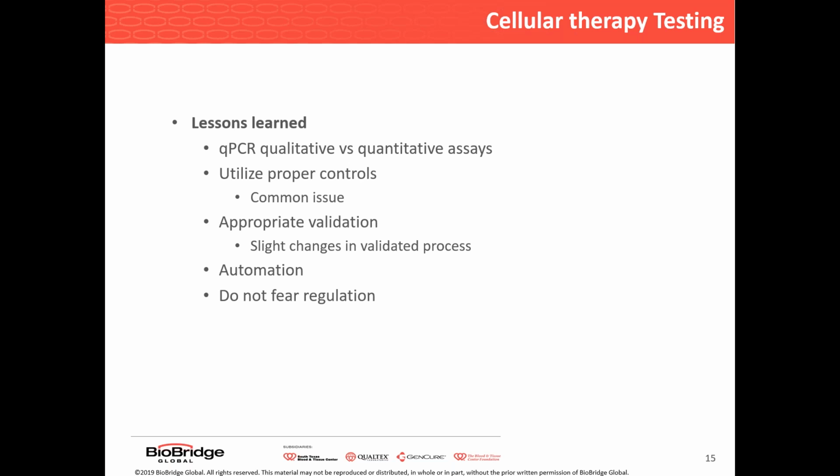And automation is another thing to consider. We currently, in the donor screening world, do a lot of automation. The equipment is automated, and we're now also adding track systems to automate the movement of tubes between instruments. It really adds a lot because it increases the quality and puts more quality controls in there. It really helps with reproducibility and standardizes everything you do.